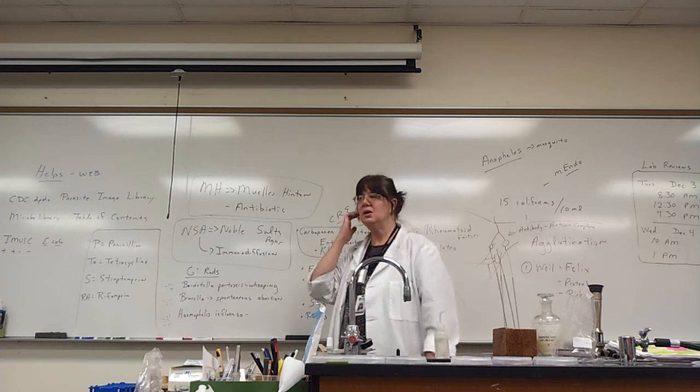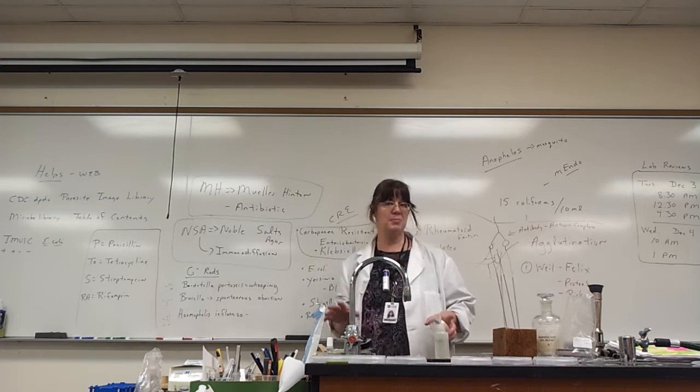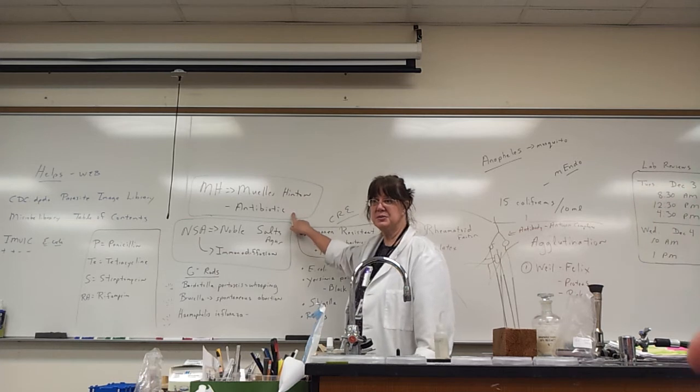Okay, let's reiterate that one more time because I'm not in a hurry. I'm here to help you understand. This is the plate used for the antibiotic test. You measure zones of inhibition. Is the organism sensitive or resistant to the antibiotic?